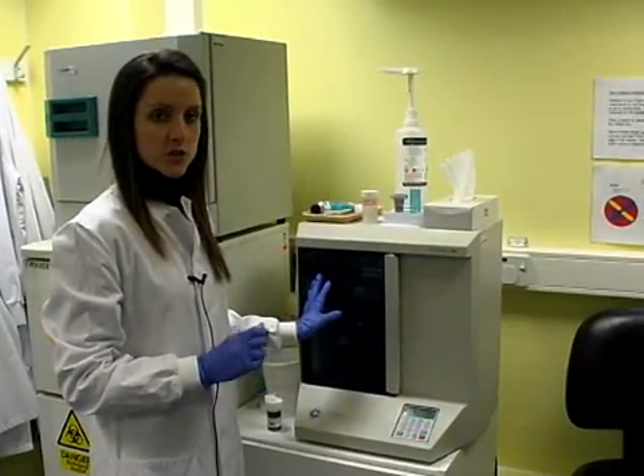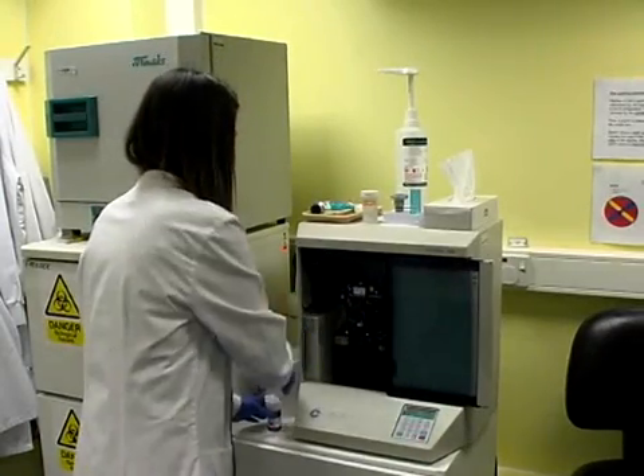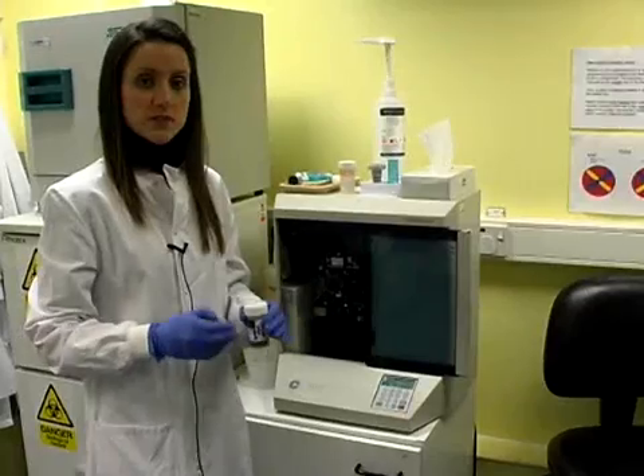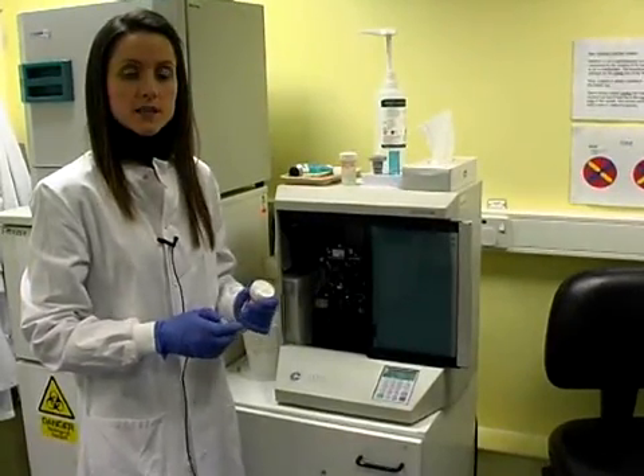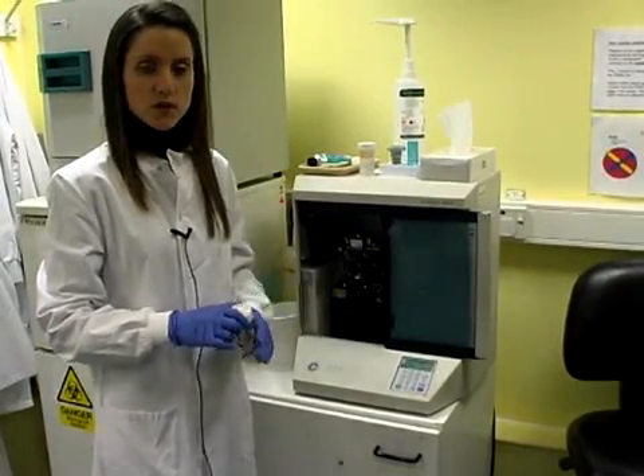This is the T2 machine. Compared to the T3 machine which runs 40 samples in one go, this machine runs just one sample on its own. This is for samples which have come off the T3 as being too dilute, so they need to be remade on the T2. We also do non-gyny samples on it depending on how mucoid they are.